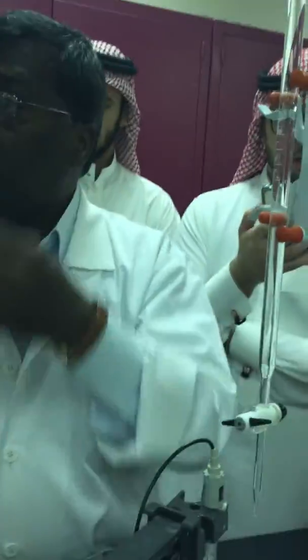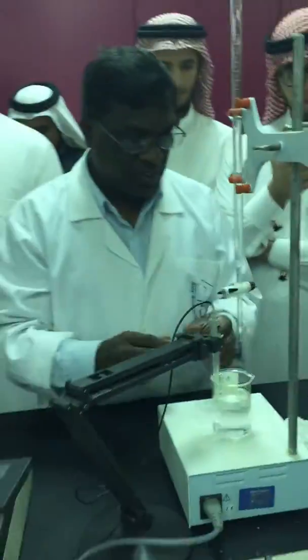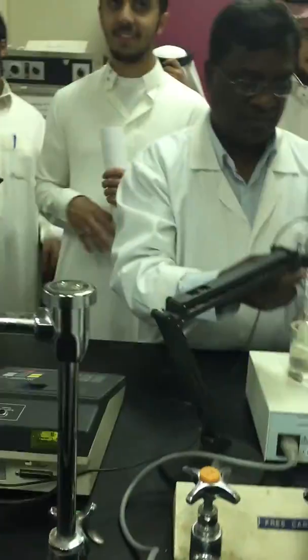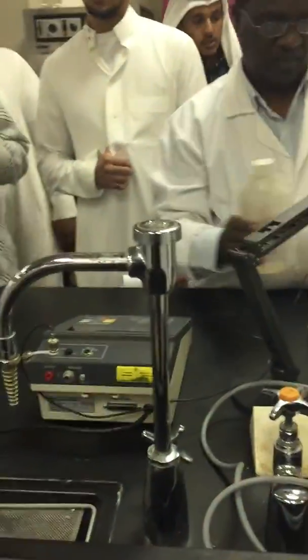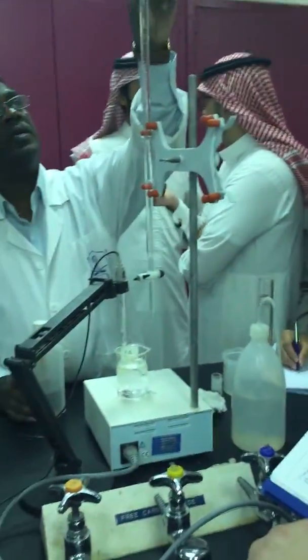Anyone has a sheet? Anyone has the notes, sheets for all the experiments? Or no sheets? Nothing? Because if it is there, we can check. I will check. Okay. After this, you have to take the reading. This is 7.3 minus 0.